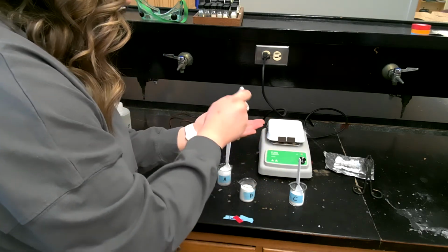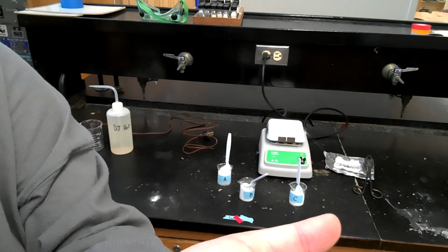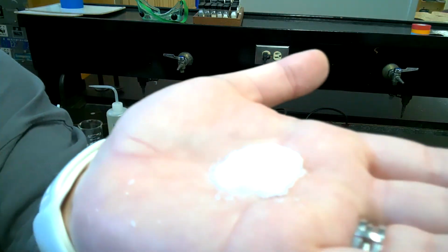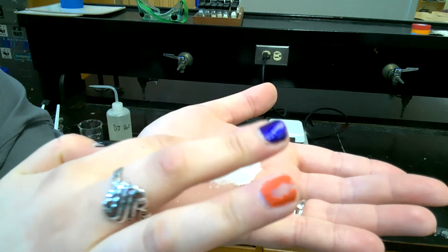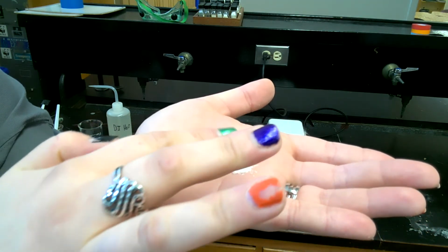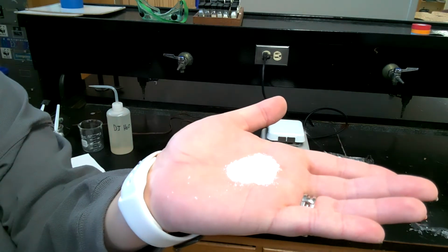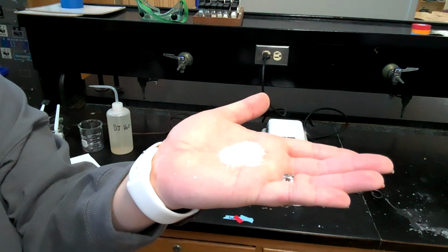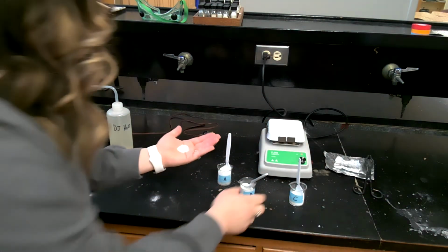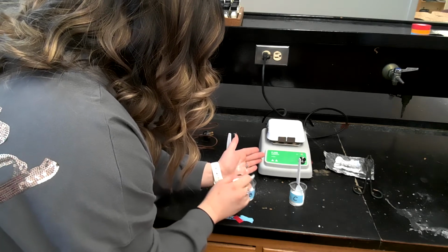So substance B, just like substance A, it's very fragile feeling. It's softer, but it also has kind of a shiny appearance to it, so very crystal-like, and it's also very soft, and I can flatten it a little bit easier than I could with the white substance. But it also feels kind of grainy, so when I move it in between both my fingers, it feels kind of grainy as well. And its appearance and its color is also white. Okay, so that's substance B.